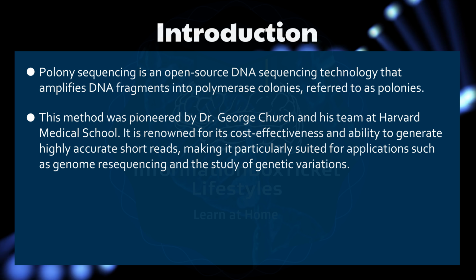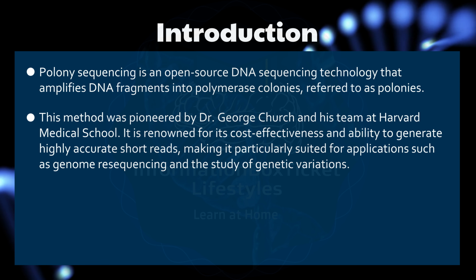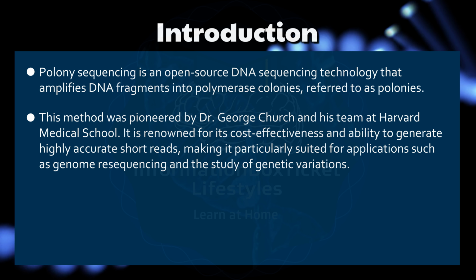Introduction to Polony Sequencing. Polony sequencing is an open-source DNA sequencing technology that amplifies DNA fragments into polymerase colonies, referred to as polonies. This method was pioneered by Dr. George Church and his team at Harvard Medical School. It is renowned for its cost-effectiveness and ability to generate highly accurate short reads, making it particularly suited for applications such as genome resequencing and the study of genetic variations.